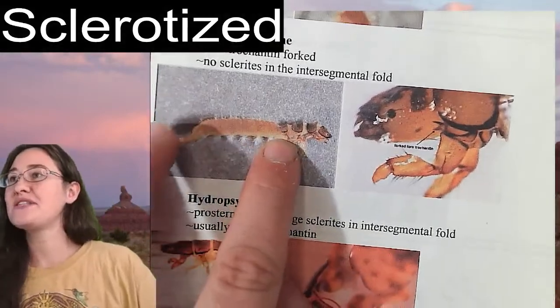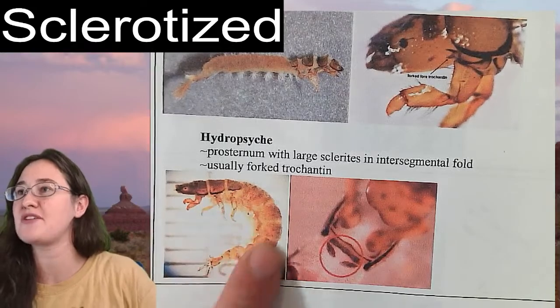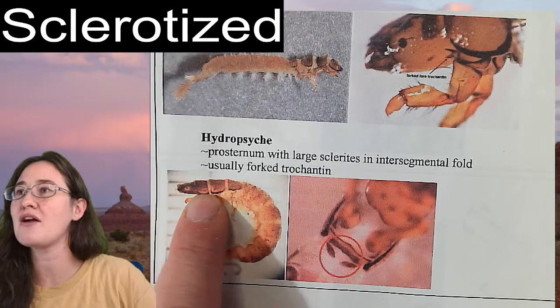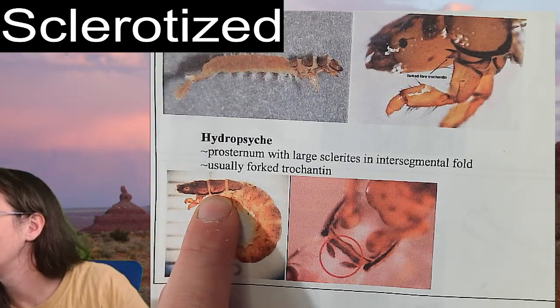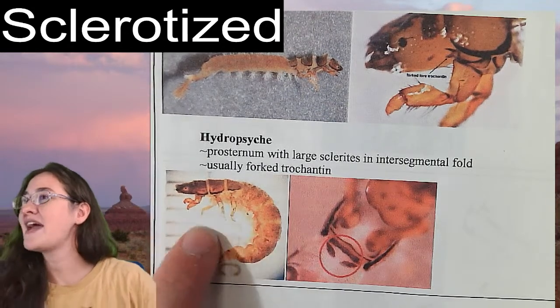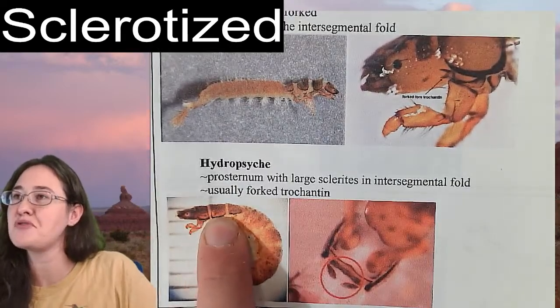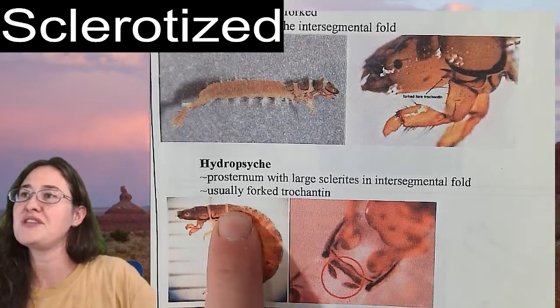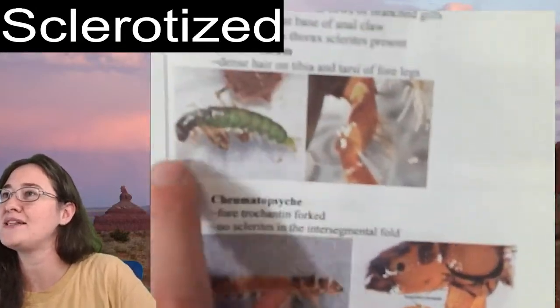You can see them here. When you look at them under a microscope, it's super obvious where the exoskeleton is really soft and squishy and where it's hard up here on top, like little plates. Hardened head capsules, yes, and then they have them on the pronotum, the mesonotum, and the metanotum. So the first, second, and third segments of our thorax all have these little plates on the top.